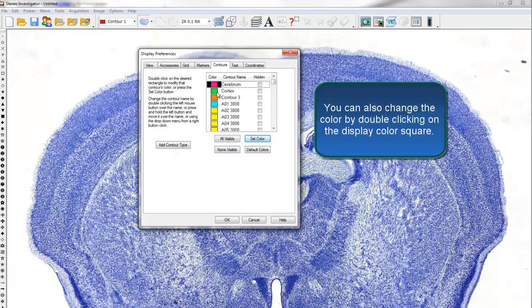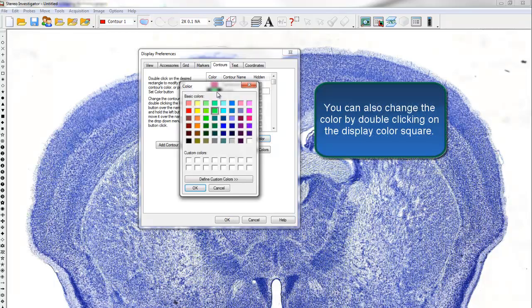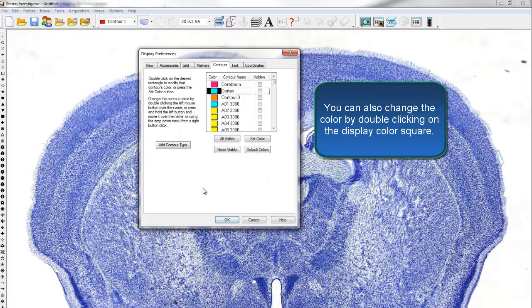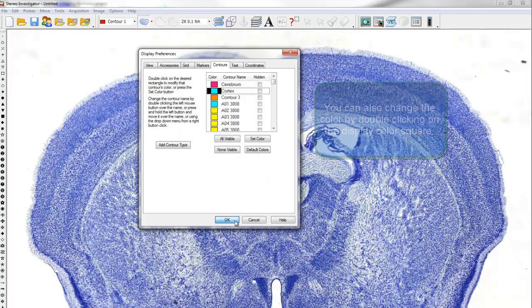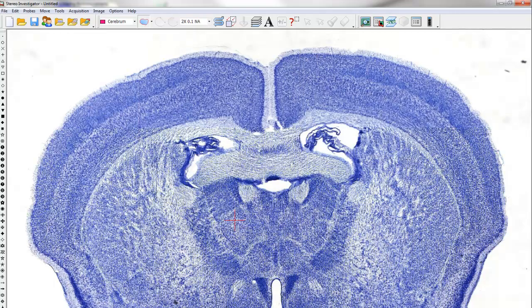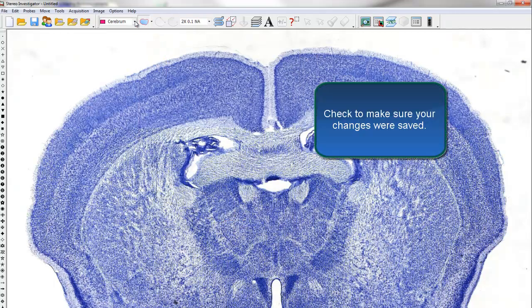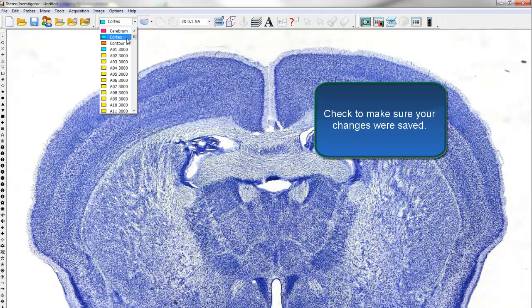You can also change the color by simply double-clicking on the displayed colored square. Click OK when you are done editing. Check to make sure your changes were saved.